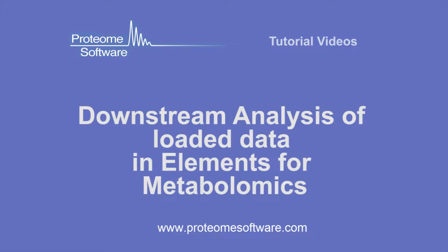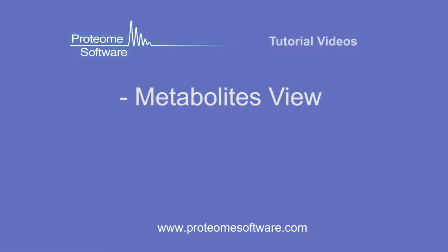Welcome to Elements for Metabolomics training video number 3. In our first two videos, we showed you how to load, process, and organize your data with Elements for Metabolomics. In this third video, we'll follow up with downstream analysis of your data using both the metabolite view over here and the visualized view.